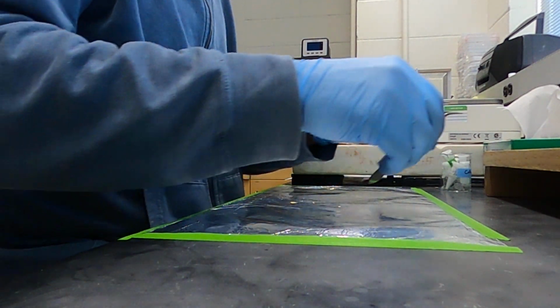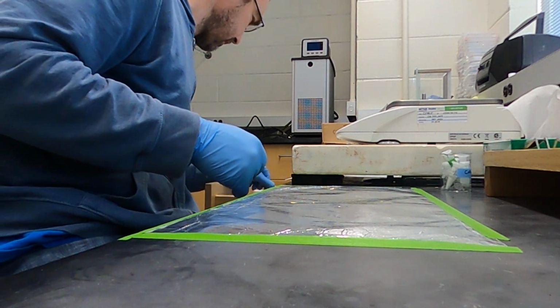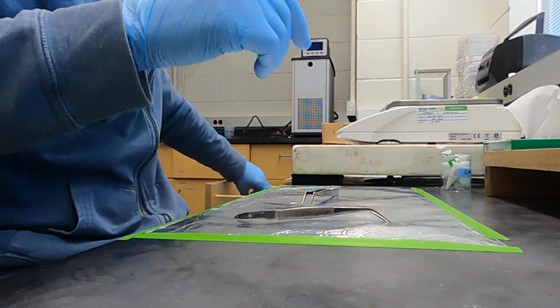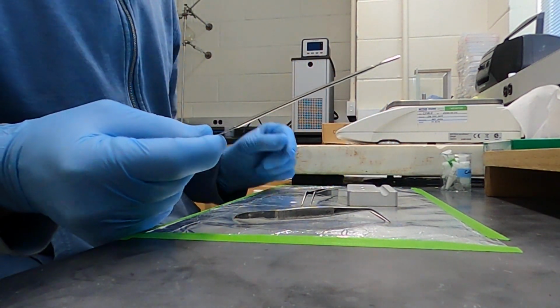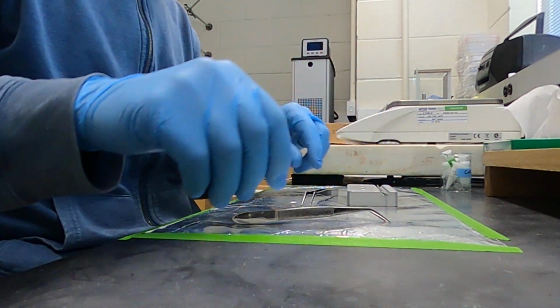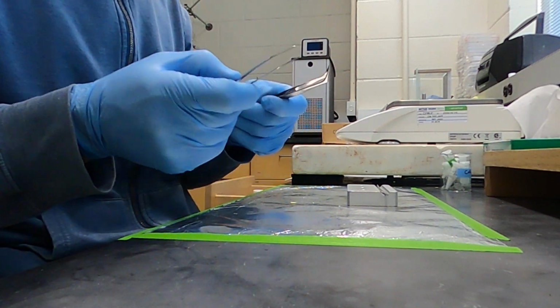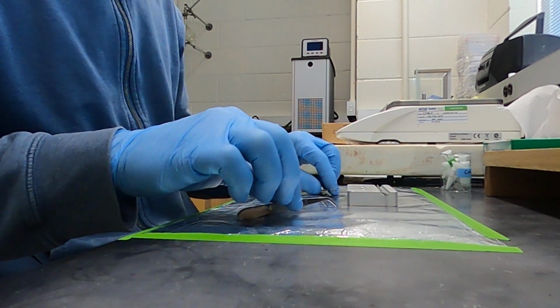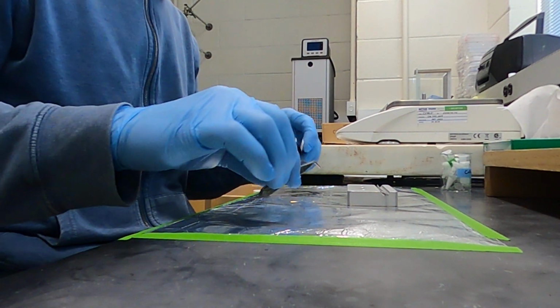So, how do we weigh for carbonates? First of all, we use clean tools. I'm going to use all of these tools here. This will be to scoop the carbonate powder, and this will be to fold the piece of paper that I'm gonna use. And you'll see these are necessary because if I want to do this with my finger, it's gonna go all over the place.